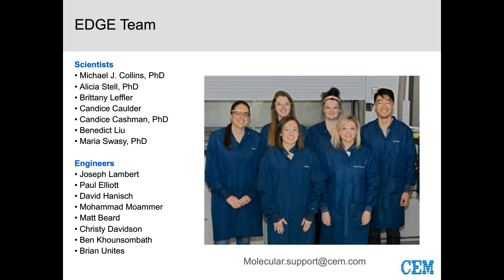But when we start getting into more packaging and polymer-like samples, if you can imagine doing extraction of those, we need to be able to transform them, right? Get to that molten point where we're absorbing into the sample. To do that, we do need to add a little more time to the method.